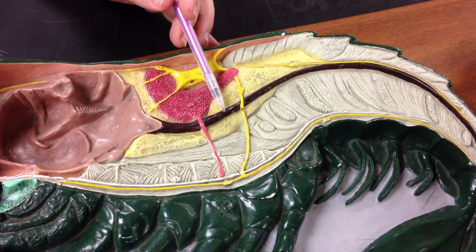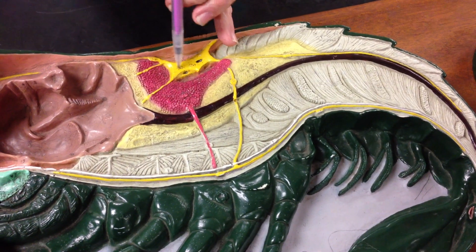Going back here we'll find the gonads, digestive gland, and intestine. That's an ostium — that's a hole in the heart.